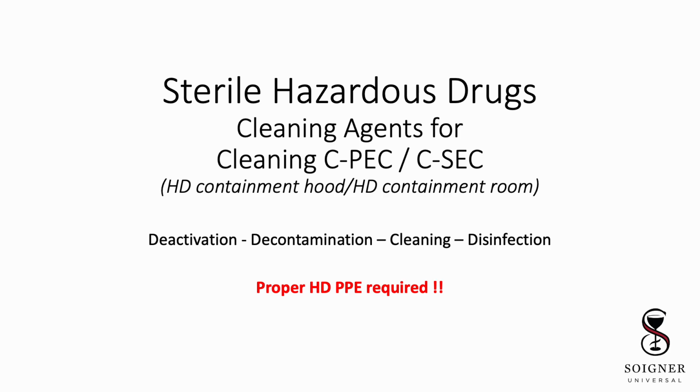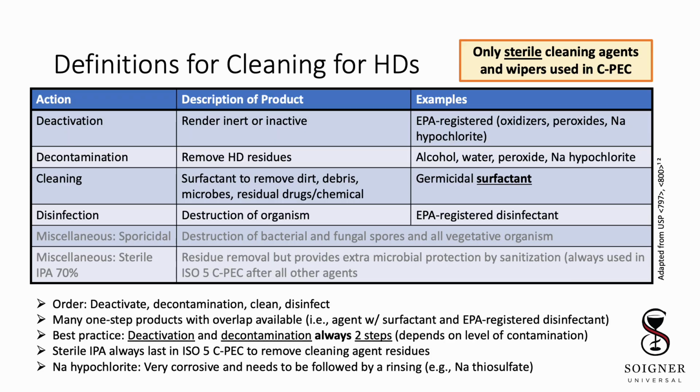Cleaning and disinfecting compounding areas are important for sterile compounding, as we've discussed in previous modules. However, for sterile compounding of hazardous drugs, we have to introduce deactivation and decontamination. Next, we'll go over this process. Just like in the non-hazardous module, we're going to go over some definitions, some new and some that were introduced previously.